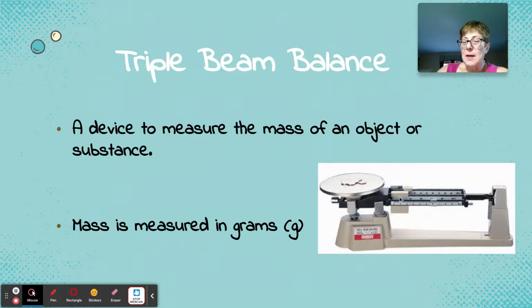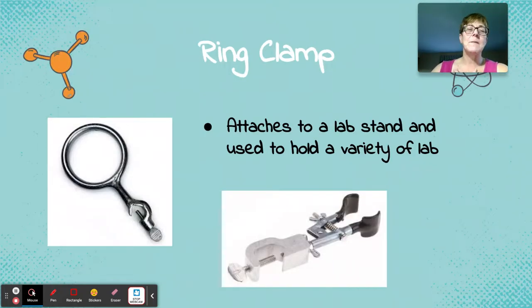Just a friendly reminder, the middle arm measures hundreds. So each time you move this, it's 100. Each time you move this, I want to say it's 10, maybe. I can't see it. And these are by ones. Okay. We will practice how to measure these because when you get into high school, you have to be pretty fluent in this. Okay. So we'll practice that.